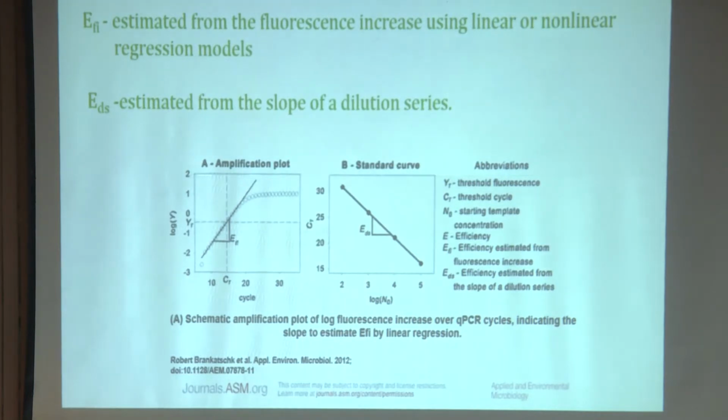The point is, although the equipment is very sturdy, robust and easy to use, if you do not understand the basic concept, the ideas which have gone into the quantification protocols or methods, you may not be able to use them to your advantage. So, you should know the ways one can calculate the efficiency.